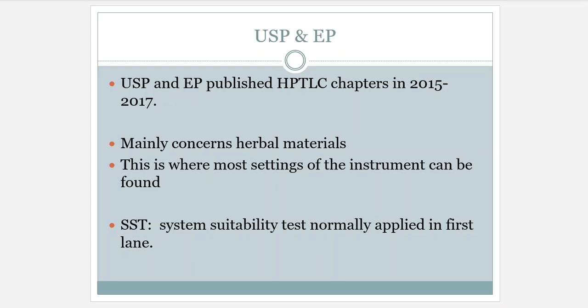Currently, they put a focus on herbal medications or dietary supplements. They've strayed away from a lot of the drugs. They wanted to pinpoint one or the other. Dietary supplements had looser restrictions, so that's the route they took first, and those are the incorporations they began with. That's where most of the instrumentation settings are going to be found, in the general chapters.